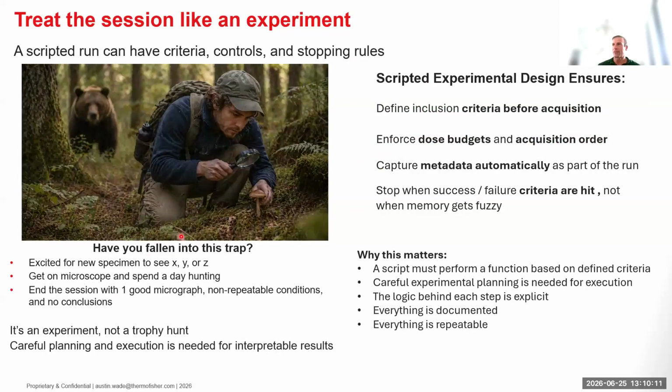This is a very nice slide that illustrates the situation. It's an analogy to a treasure hunt, or in this specific case, trying to find a mushroom in the woods. Many microscopy sessions, unfortunately, become what we call a treasure hunt. We sit down with an interesting sample, spend hours searching for something exciting, and eventually come away with one beautiful image, but often without a repeatable workflow or statistically meaningful results.